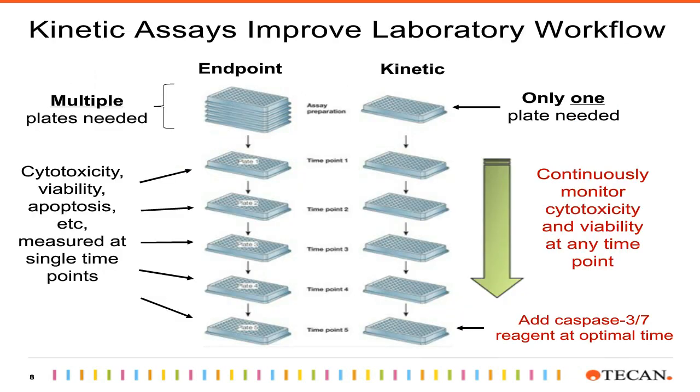Considering that the compound mechanism of action is often not known, multiplexing cell viability, cytotoxicity, and apoptosis assays is one way to distinguish apoptosis from necrosis, for example. The timing of drug exposure and then assaying for that effect is imperative in understanding the biological profile of your unknown. Oftentimes, time course treatment is used and recommended to have a better understanding of the kinetics of cell death due to that drug exposure.